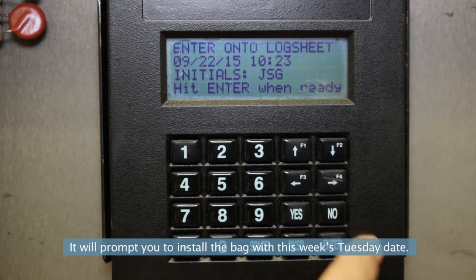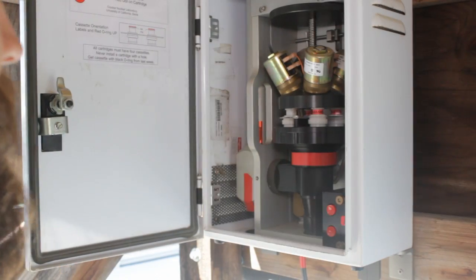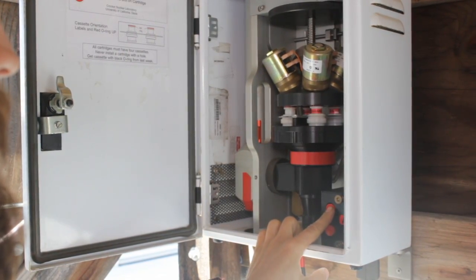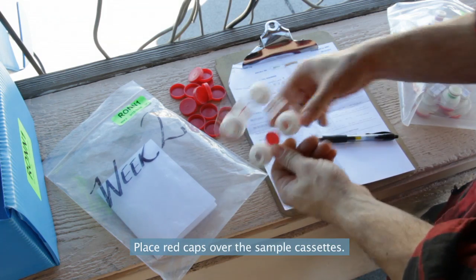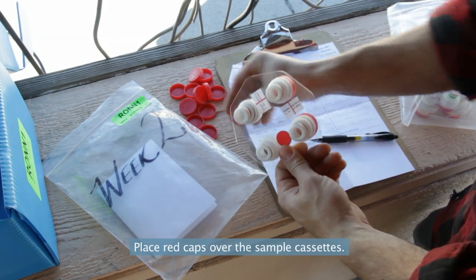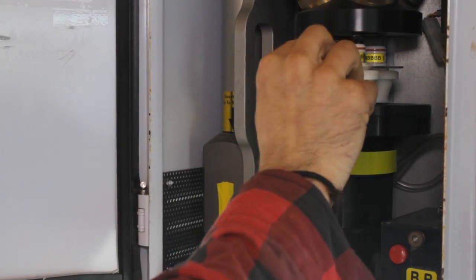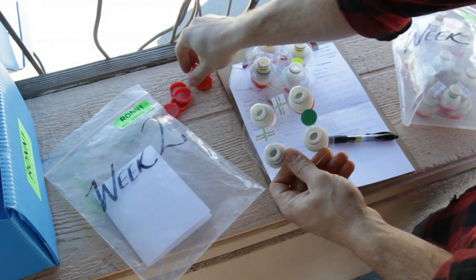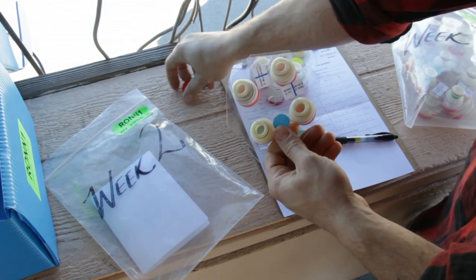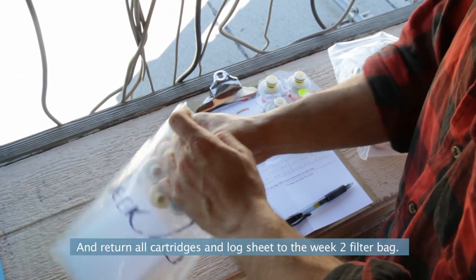It will prompt you to install the bag with this week's Tuesday date. Place red caps over the sample cassettes, and return all cartridges and log sheet to the week 2 filter bag.